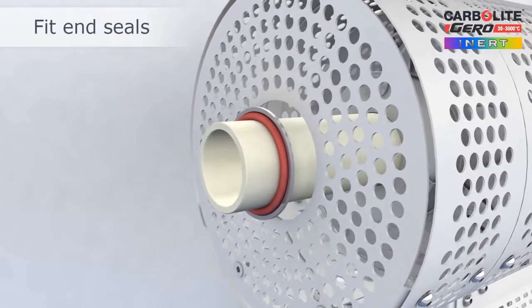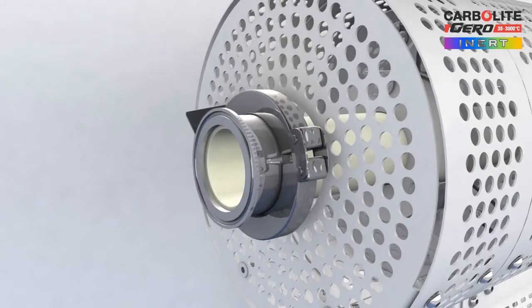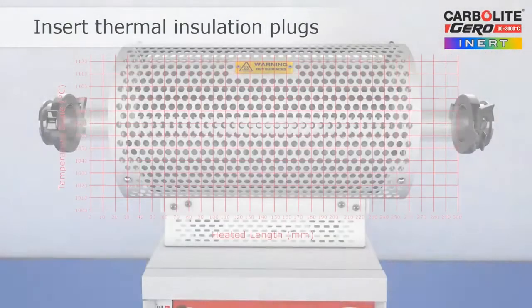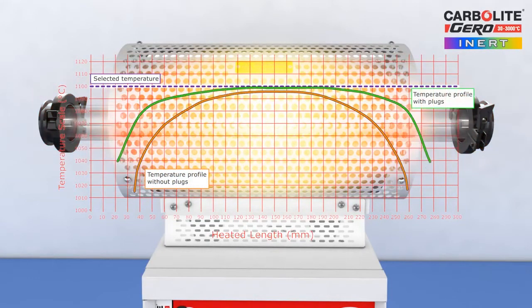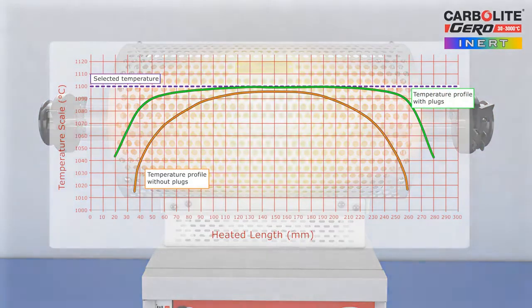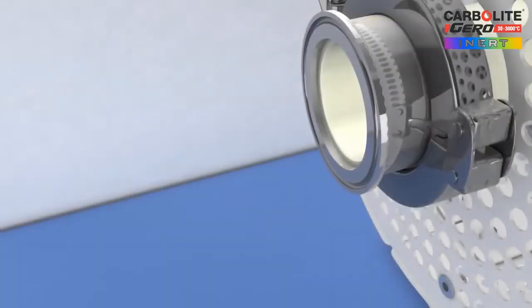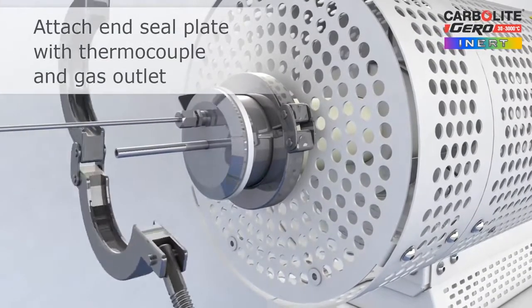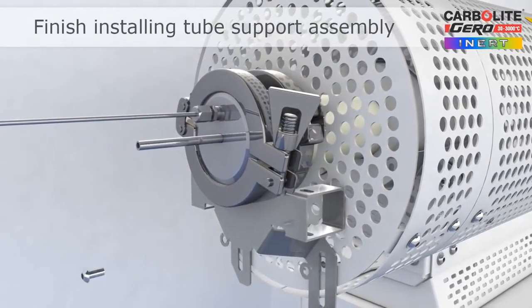The first parts of the end seals are attached to the work tube and can permanently remain in place. The sample to be heat treated is inserted into the work tube, followed by the insulation plugs. The end plugs consist of thermally efficient insulation materials and are required for three reasons: one, to prevent heat loss; two, to improve the temperature uniformity inside the work tube; and three, to protect the end seals from very high temperatures inside the work tube. The end seal plate is fitted and clamped in place to provide a gas-tight assembly. The remainder of the work tube support assembly is then fitted.